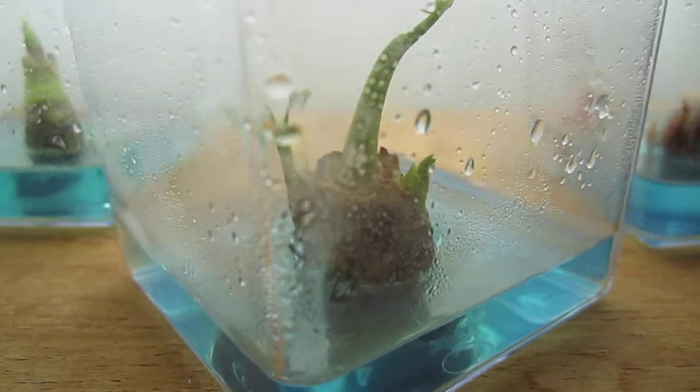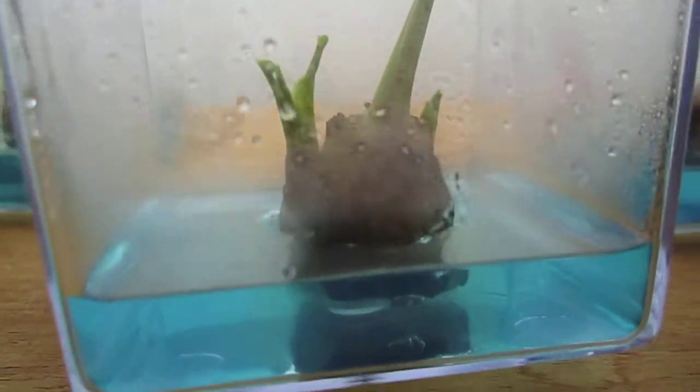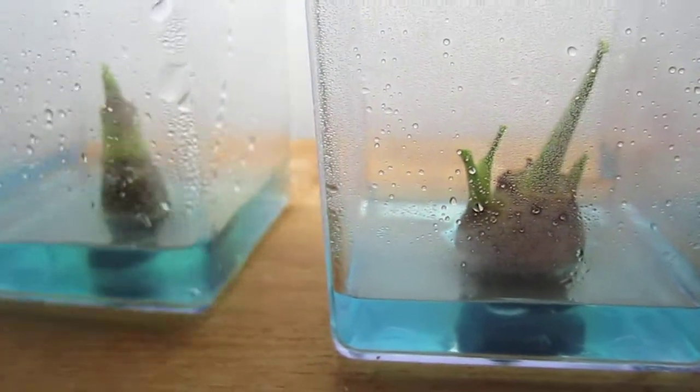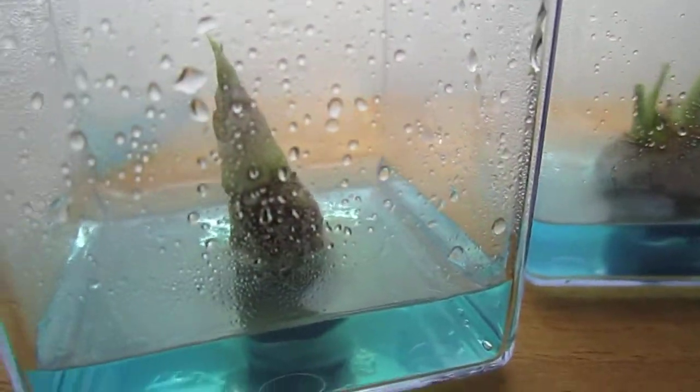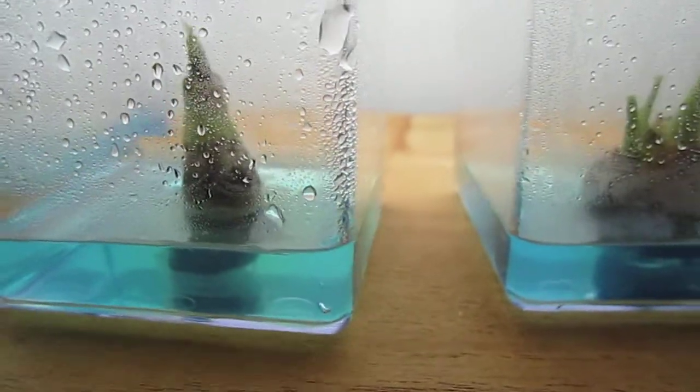I think it's doing rather well. You can see it going out of the lights. And this is another one planted about the same time. It doesn't have any side suckers yet, but we hope for the best.